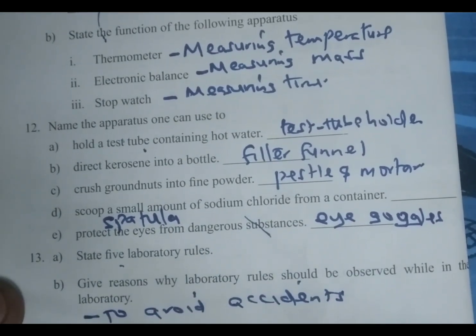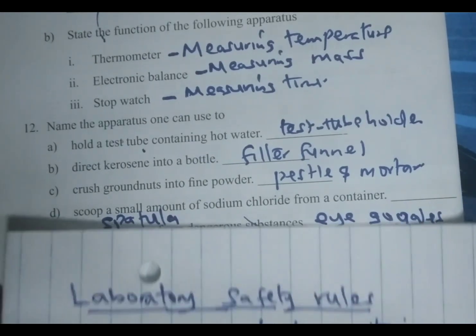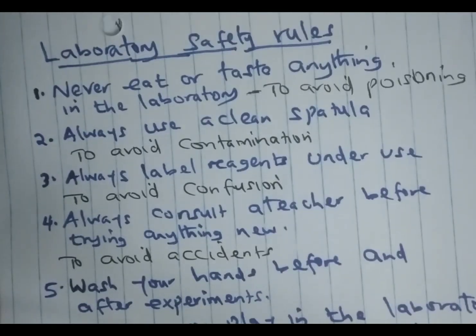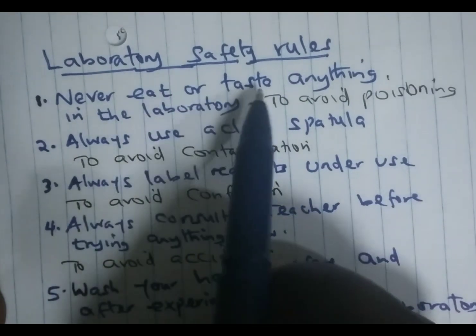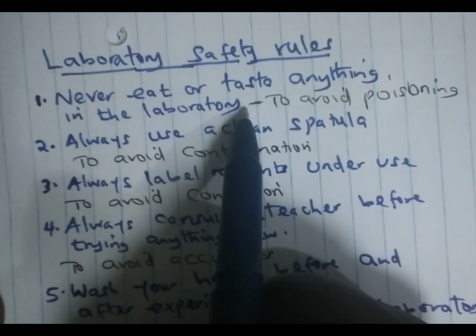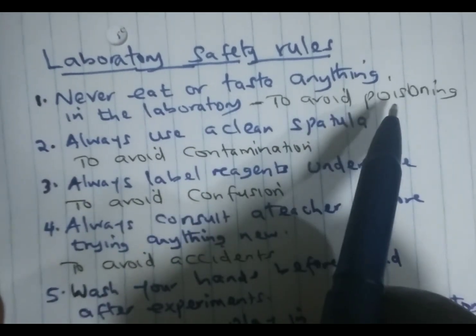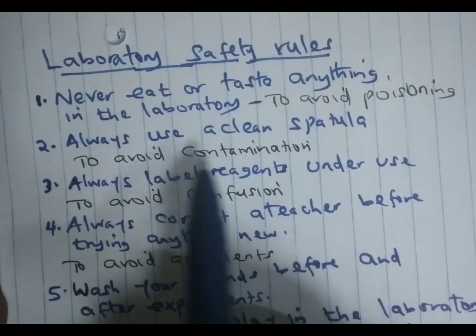Next, now we look at laboratory rules. One, never eat or taste anything in the laboratory, and the reason why we are not supposed to do that is to avoid poisoning, since the chemicals we use are poisons.